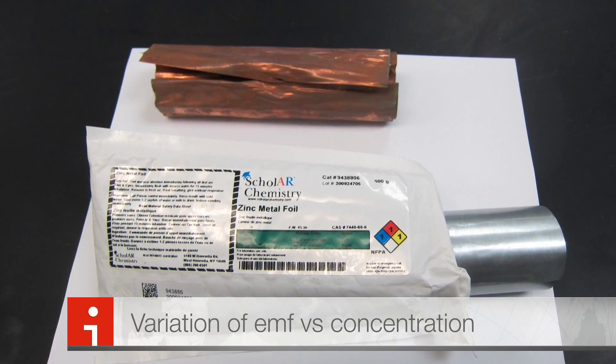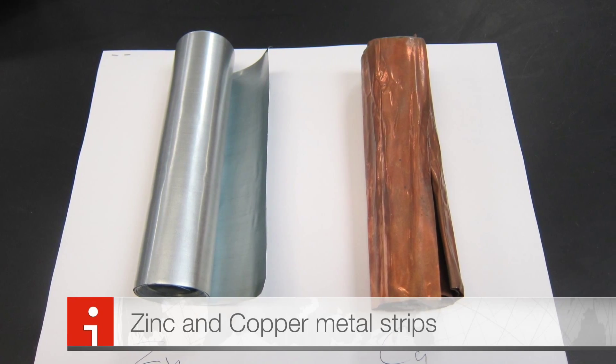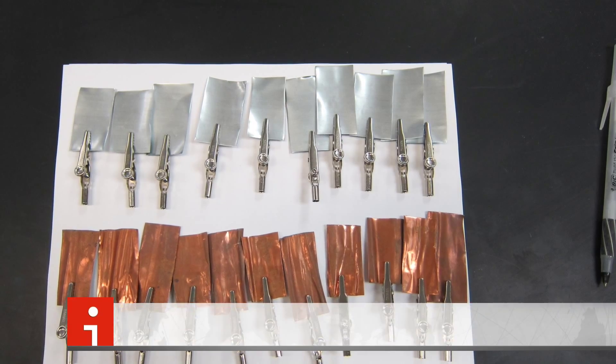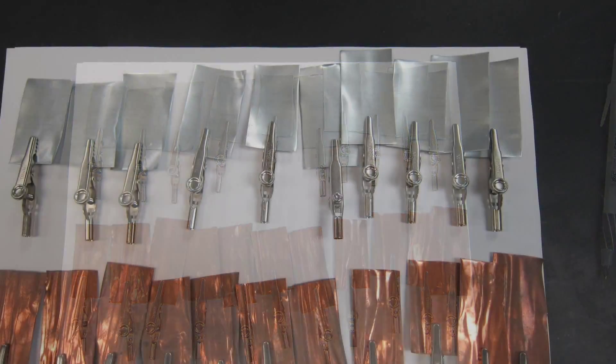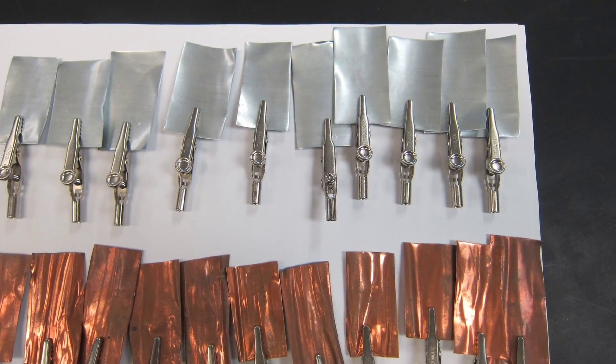The materials that you require for it are copper metal and zinc metal in thin sheets. Cut them into small sizes of 3 by 2 cm and connect them to crocodile clips.